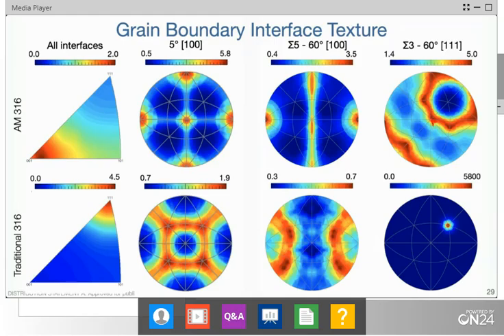of boundary, the 001 interfaces. The rest of these peaks are simply symmetric reflections of that one. So again, we have this preference for 001 interfaces. And so we find this to be very intriguing.